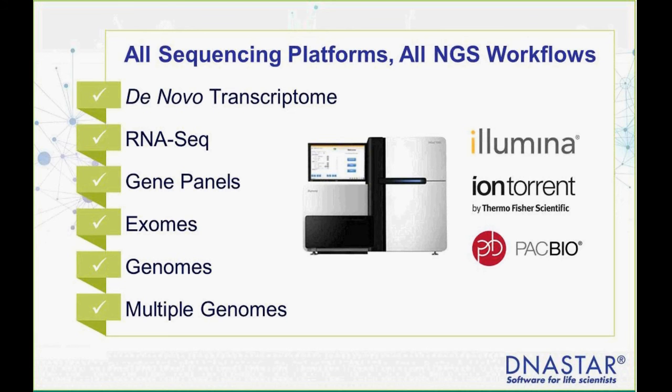You may have a biological sample and you want to know the gene expression, and you want to know the variations in that same sample. And so really the webinar today is focusing on how we can cross-compare these different workflows in a streamlined manner, in a more efficient manner.